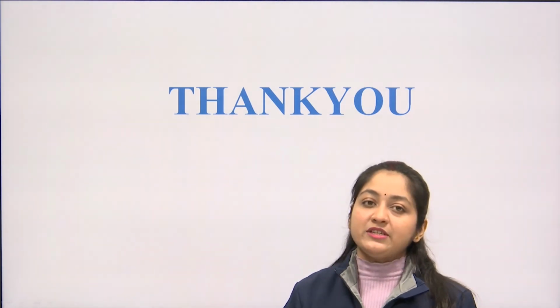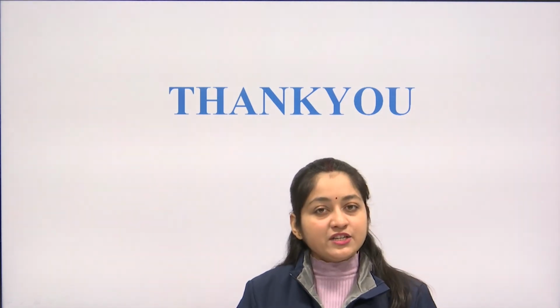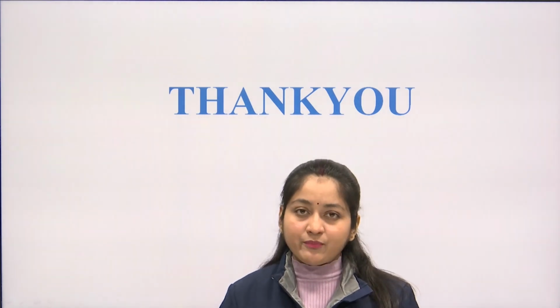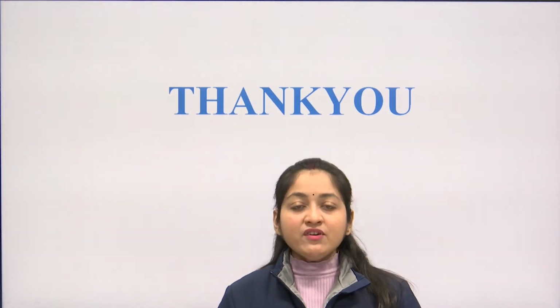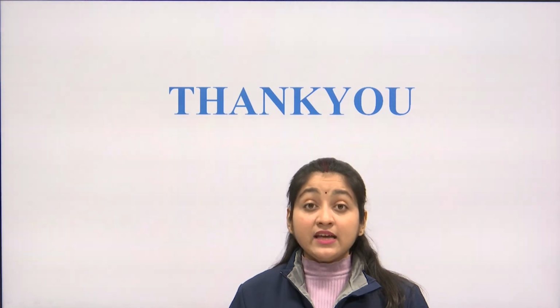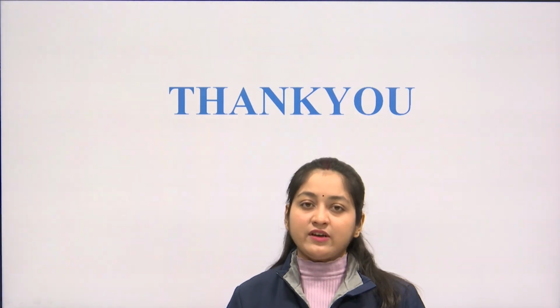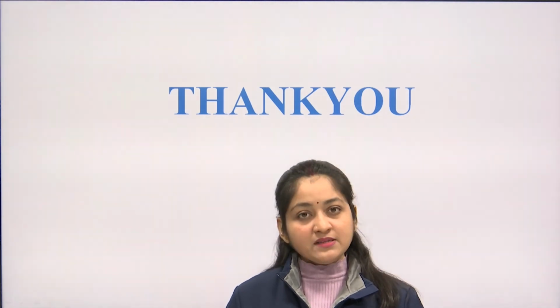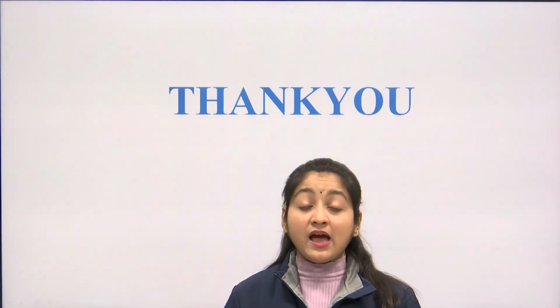Going through all the parameters of evaluation that we just went through, be it the breaking test, the melting range test, the softening temperature, or sometimes the appearance of the suppository, all these tests each have their own importance in evaluating suppositories. Whenever suppositories are formulated, after formulation, the very important and vital step is their evaluation. If the suppositories do not pass the tests mentioned under the evaluation criteria, it means they are not of standard quality. Such suppositories are discontinued from the batch and have to be discarded.